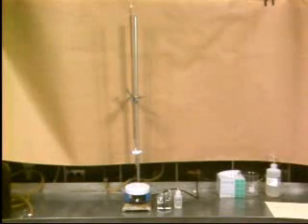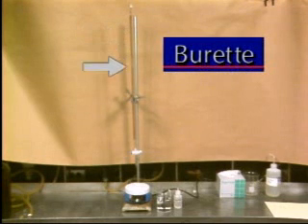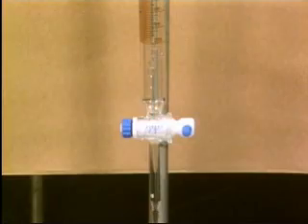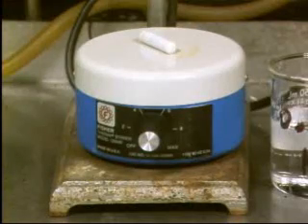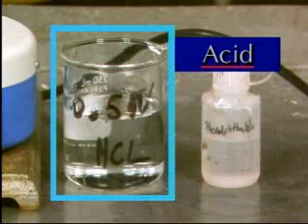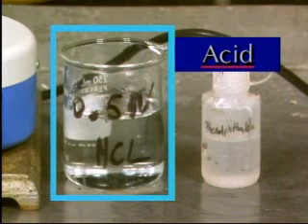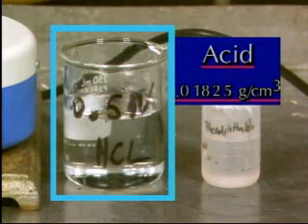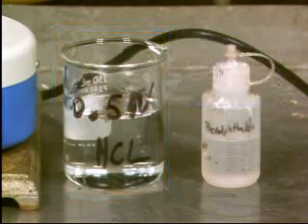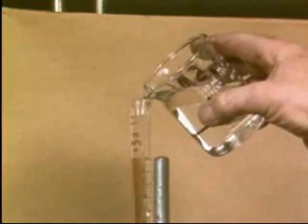We'll analyze a sample that has a volume of 100 cubic centimeters or 100 cc's. To perform the titration, we'll use a burette, which is a graduated glass tube with a valve at one end. We'll also use a mixer, an indicating solution, and a supply of acid that has a known concentration, in this case, a concentration of 0.01825 grams per cubic centimeter. The burette is filled with the acid.